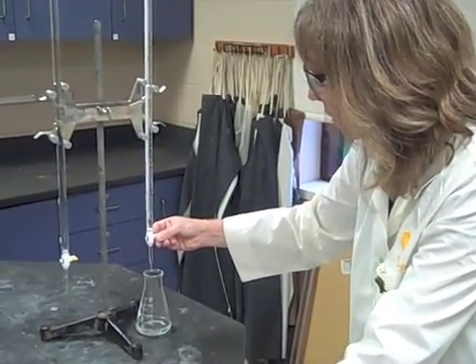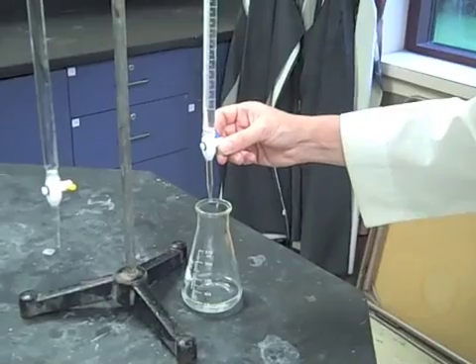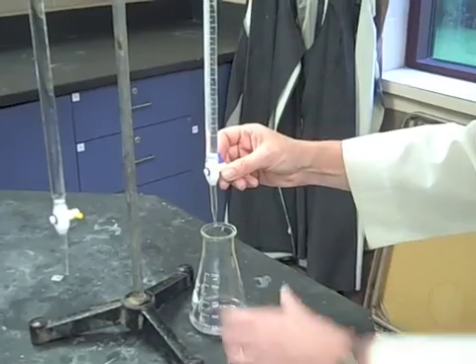So, I am going to slowly open up the stopcock where we're getting the dripping action. And when you have a partner, this is when you should have your partner, one of you controlling the stopcock and the other person should be controlling the swirling.